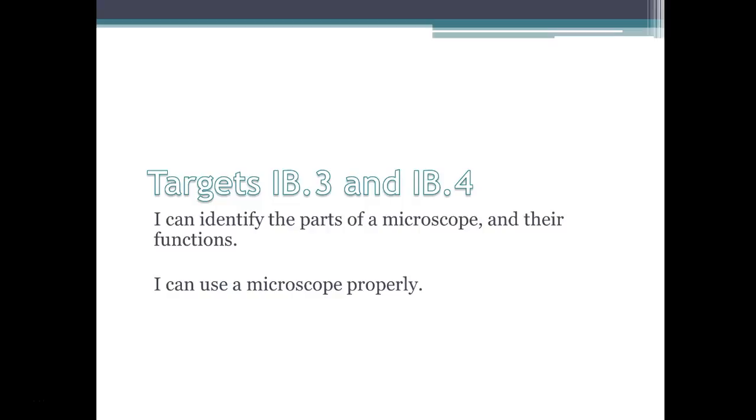to use the microscope, you're going to be in a small group. What often happens is maybe one person is very comfortable with using a microscope, has used them before, so they kind of take charge and may even tend to dominate that time. But you want to make sure that each person in your group, including yourself, gets time to actually use the microscope, that you know how to move the slide around, focus the image, get it in focus under low, medium, and high power, because you're going to have to demonstrate that during test time.